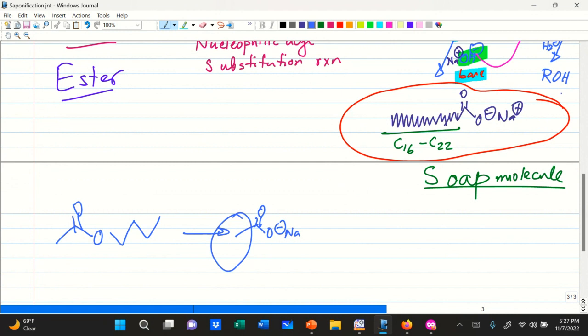But supposedly we'll be able to distill off the alcohol. If you do, you're going to get a peak for the hydroxyl in the FTIR. So you can analyze the alcohol using FTIR.